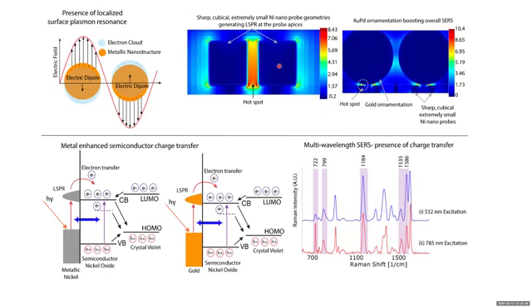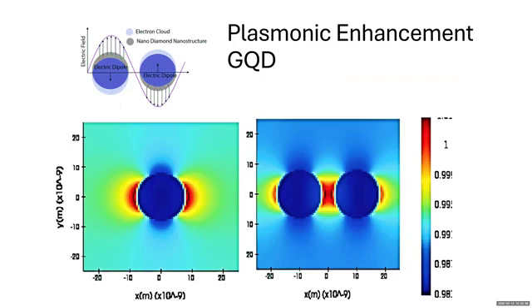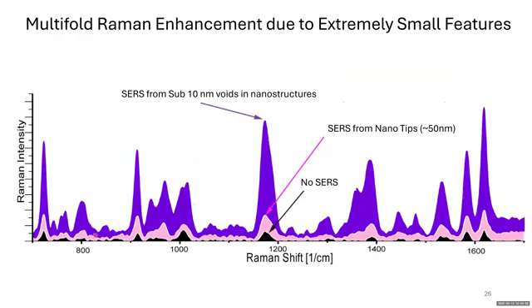I also tried to use gold nanoparticles to decorate on this nickel oxide nano platform. That improves the signal much more. Then I also tried using graphene quantum dots, zinc oxide, zinc nanoparticles. So all these nanoparticles which have semiconductor-based oxides, I tried to use to see if I get the metal-enhanced charge transfer mechanism in that.